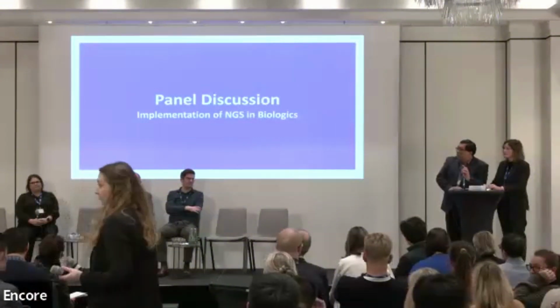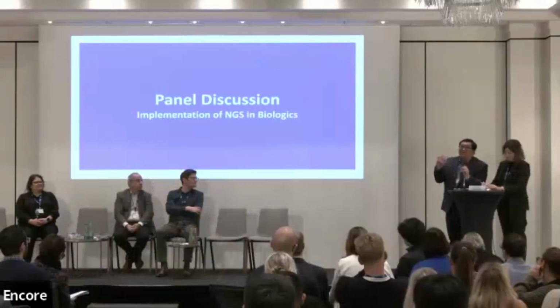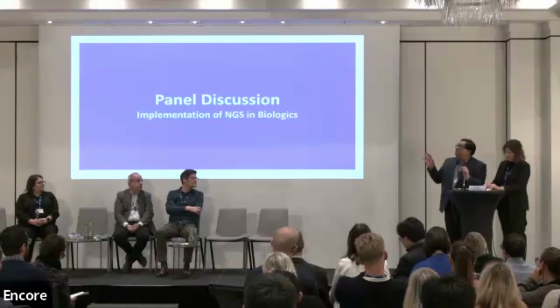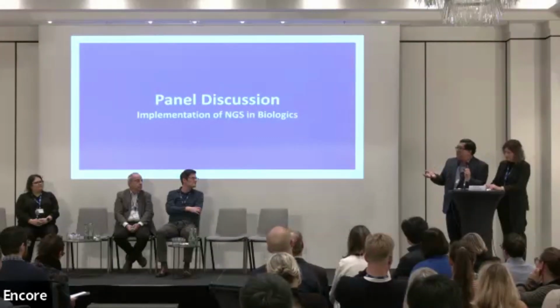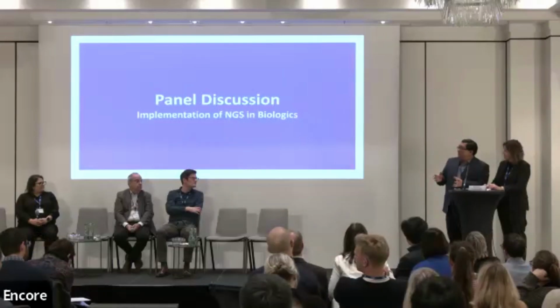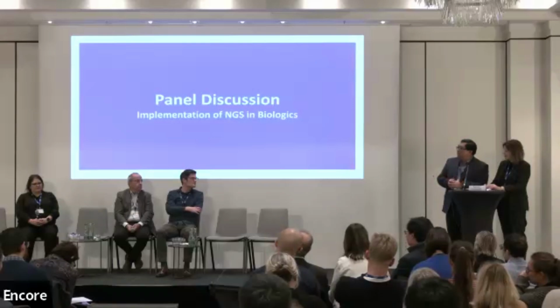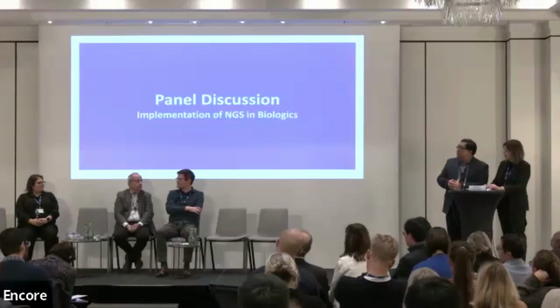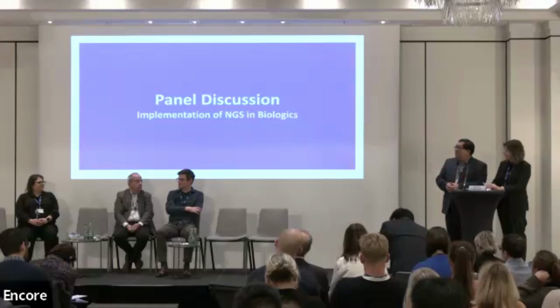I actually have a question, and I don't know if it's to the panel, maybe to the more general audience, or both. We've been seeing the slides showing the different modules and talking about the module in terms of validation. It got me wondering, as we're designing these pipelines, how much rework, from little to a lot, is there when you're thinking about short versus long reads, or transcriptomics and things like that? Are there any thoughts from anyone on whether the modularization really is modularization, or is there a lot more detail to that?